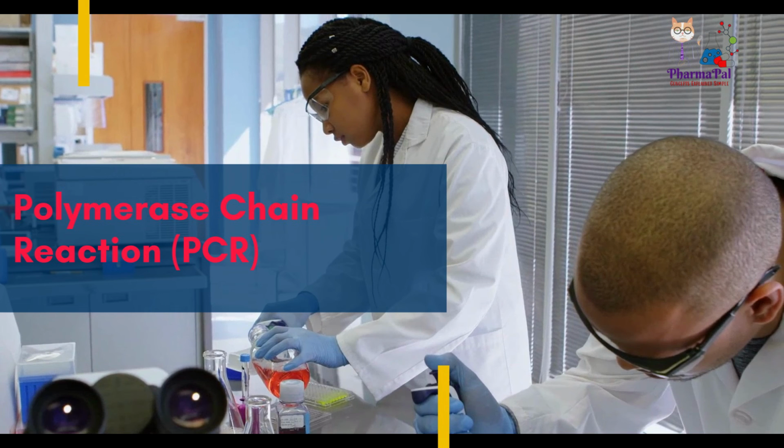Nested PCR is a technique used to reduce contamination in PCR products. It involves using two sets of primers. The first external primer set generates a normal PCR product, while internal or nested primers, lying inside the first set, are used for a second PCR reaction, generating a shorter product.